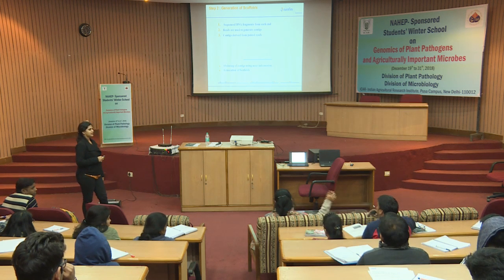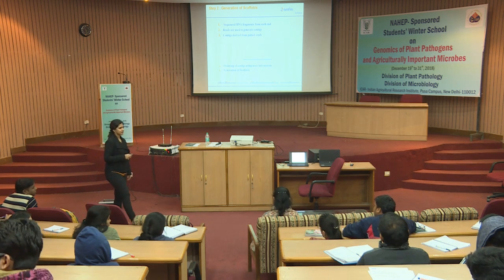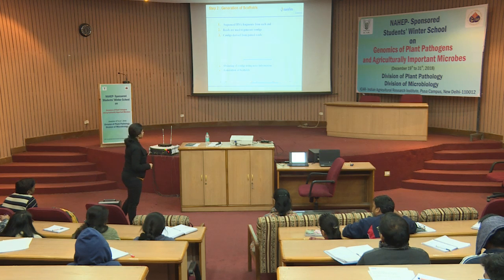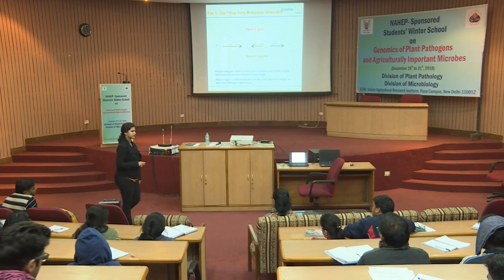Help me to understand: after making scaffolds, the regions where you put N to join the two scaffolds, you are saying that region may not have been sequenced, so we do not have overlapping of that, and consensus sequences are not formed for that region. So you are saying we are joining it based on our insert sequences, the insert information.